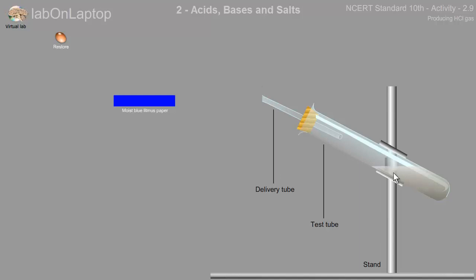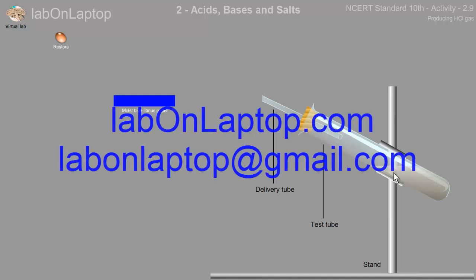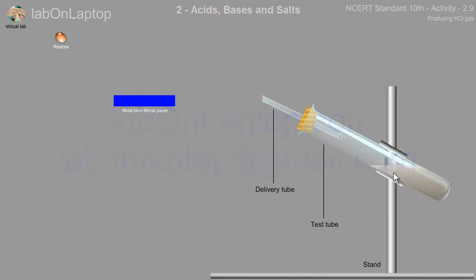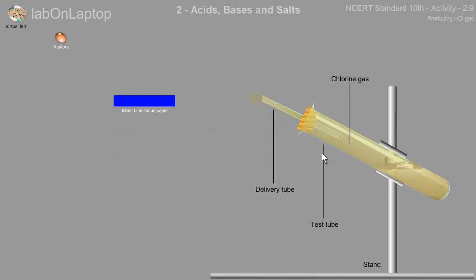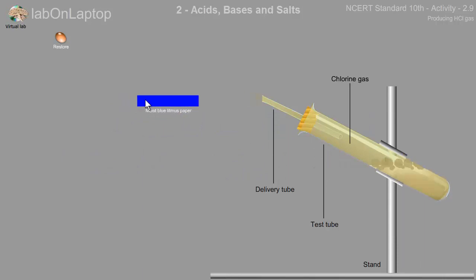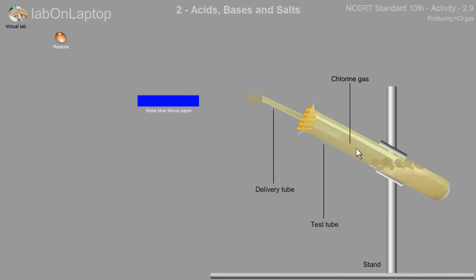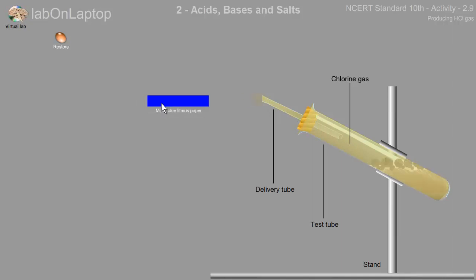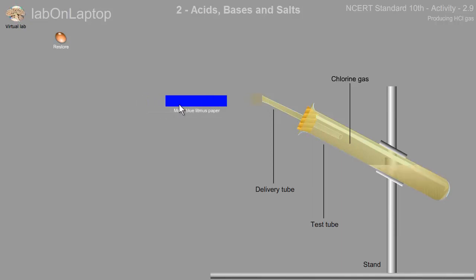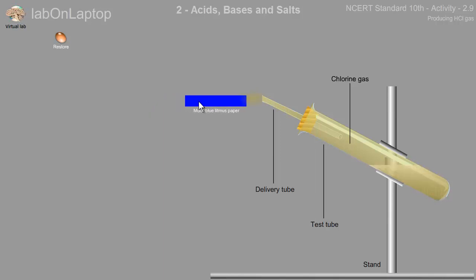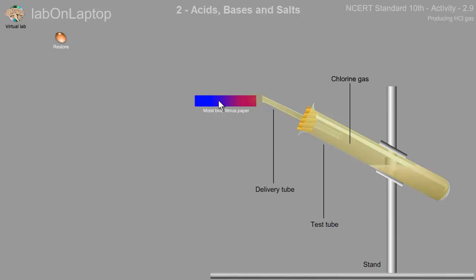Now we have to add HCL gas to the test tube.